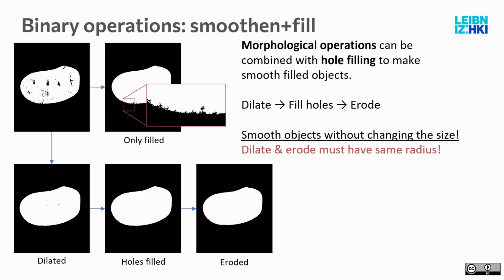But we have these annoying holes inside. Okay, we can close them with hole filling. But then you have these borders here that are a bit unclean. They are due to the issues with the segmentation. Also, there were images, where I didn't have it here, where parts were not detected properly, and then the hole filling could flow basically inside because there was a path to the inside. So there's a simple protocol to solve both.